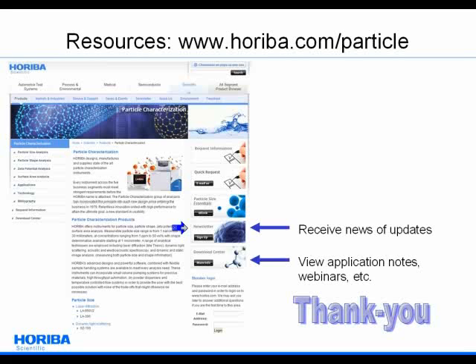And if you read the ISO standard on using dynamic light scattering, it's going to tell you the same thing. Make sure you do a dilution study and that you're not seeing dramatic changes with dilution. When you do these dilution studies, it'll actually give you information of what's going on with the particle-particle interactions. But make sure you do that dilution study if you're tempted to reach for DLS. So in summary, make sure you do the dilution study.